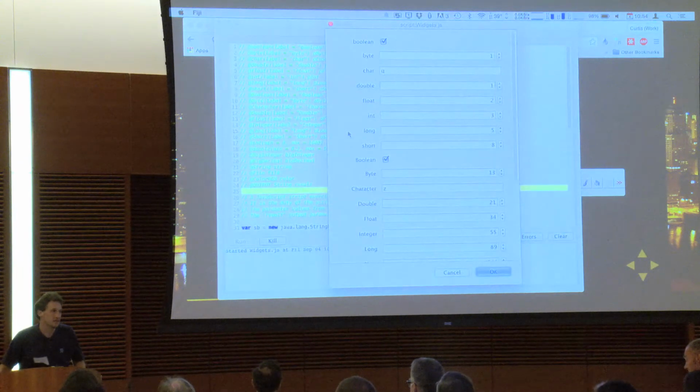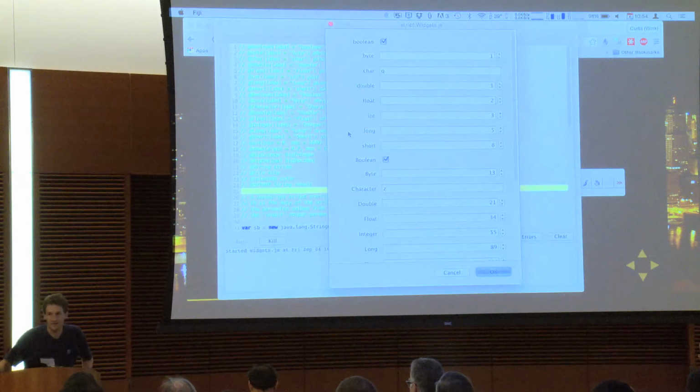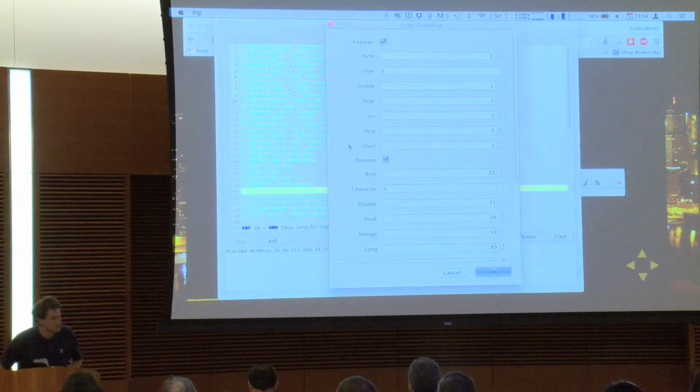The only catch is that the system might not know how to ask the user, right? So if I make up a person object that has arms, legs, and a head, how do you ask someone to choose or define a person in the user interface? It may not be well formed, the idea. So we have built into SciJava and ImageJ2 quite a few different types that work in the UI, and that's what this widgets demo thing is. It's showing off those widgets. A widget is a UI tool for harvesting a particular type of input.